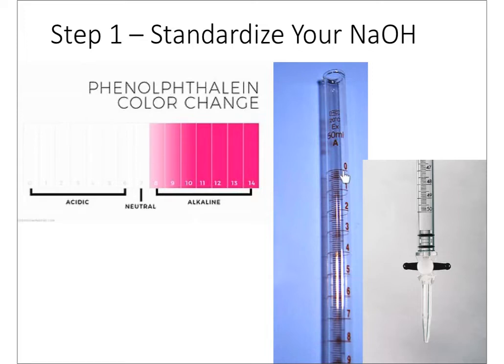And if you were exactly here at the top, you would record your volume of 0. And then you're counting how much volume of NaOH that you're adding as you move down. Once your solution turns pink, you close your burette, and then you record the final volume. And the reason this burette starts at 0 is to find the total volume that we're using. We just use the final volume that you stop at minus the initial volume.